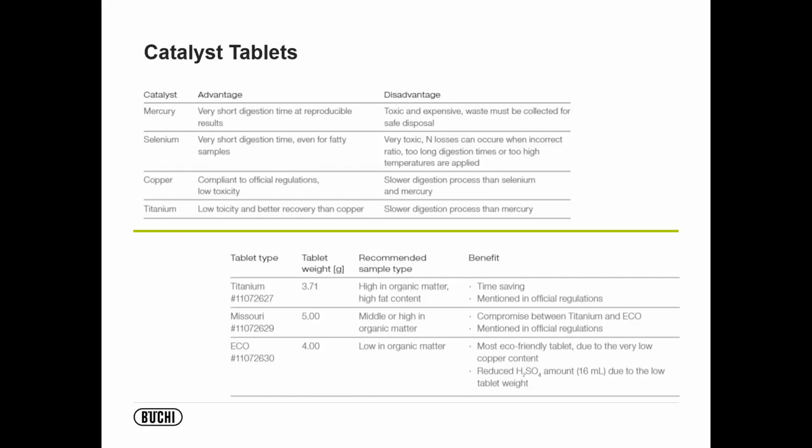And so really the moral of the story here is that there are newer types of catalysts that have a lot lower toxicity, but you don't sacrifice any of the digestion efficacy, and that there are different ones that can accommodate varying organic material composition.